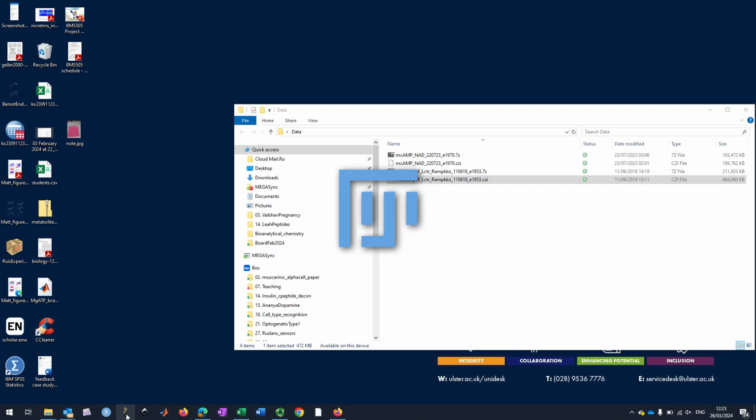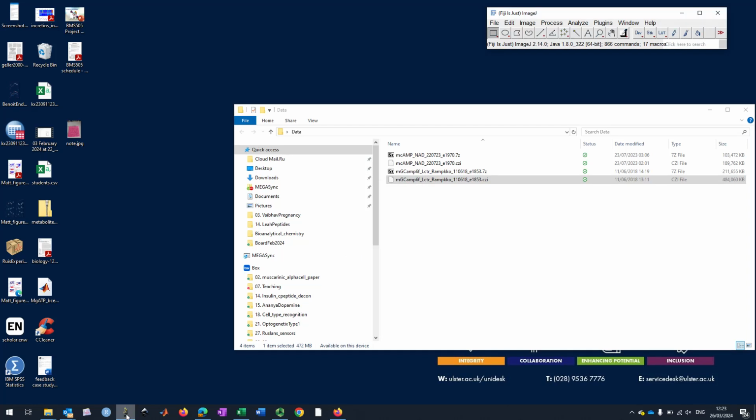And I will make sure that I have the needed plugins for that. That will hopefully be installed using this maneuver. If they aren't, you can run update once again. There's a good chance that it did not pick up the update for that particular site that we have specified. I must say it takes a bit of time for it to load on this occasion. I'm again slightly worried, but not too much. There you go. That's Fiji.